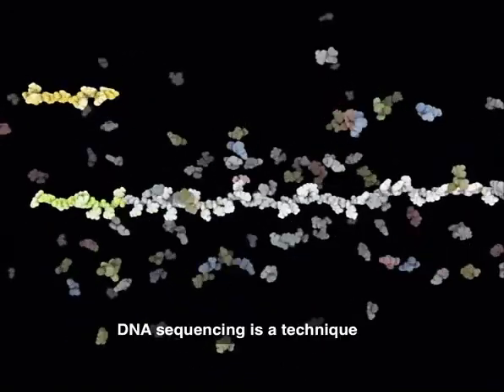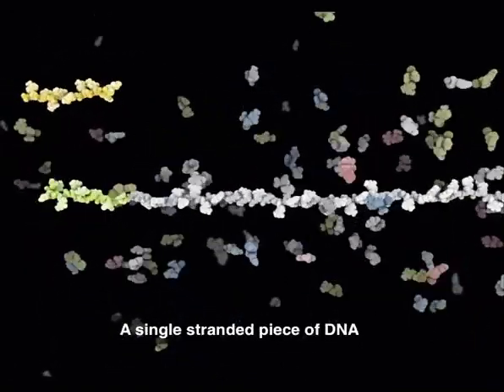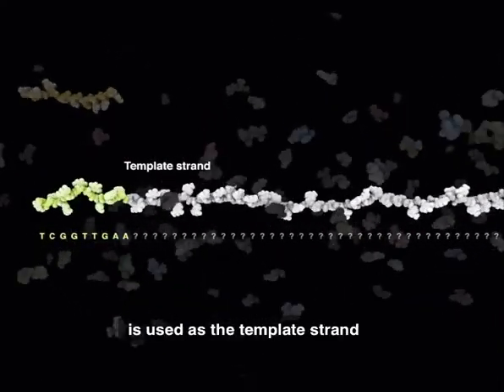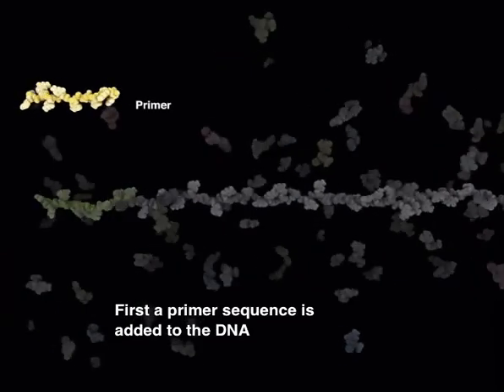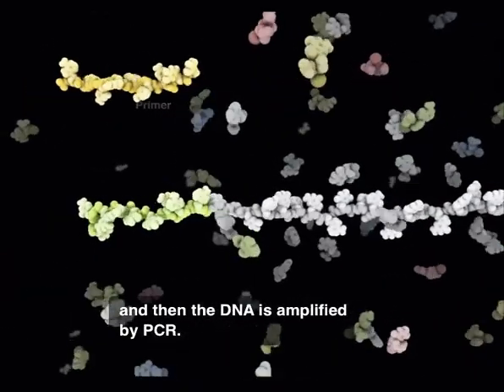Sequencing is a technique used to determine the order of DNA nucleotides within a strand of DNA. A single-stranded piece of DNA is used as the template strand to carry out the reaction. First, a primer sequence is added to the DNA, and then the DNA is amplified by PCR.